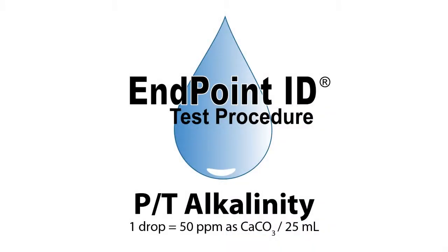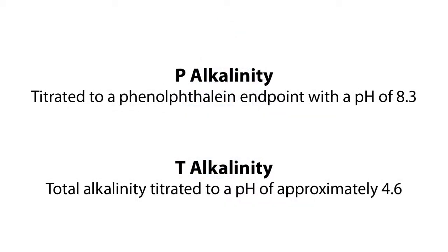This is a demonstration of a P and T alkalinity drop count test kit using Endpoint ID procedures. P alkalinity is the alkalinity titrated to a phenolphthalein endpoint with a pH of 8.3. T alkalinity is for total alkalinity, which is titrated to a pH of approximately 4.6.